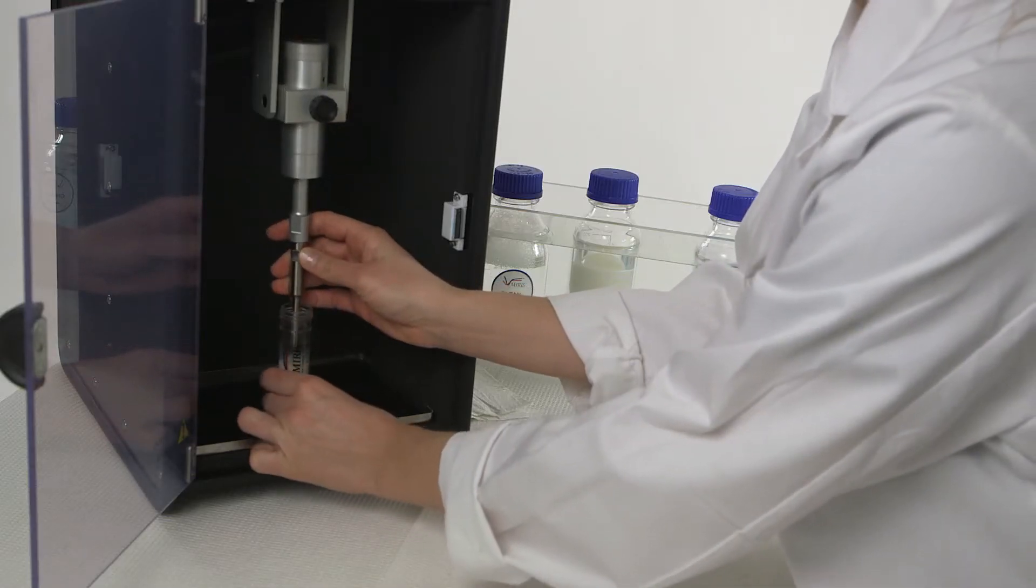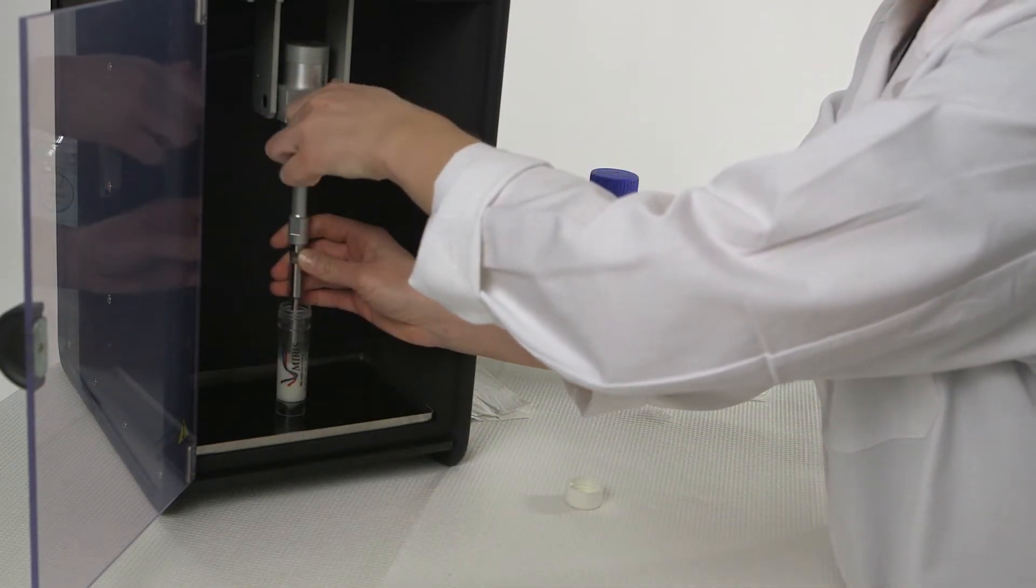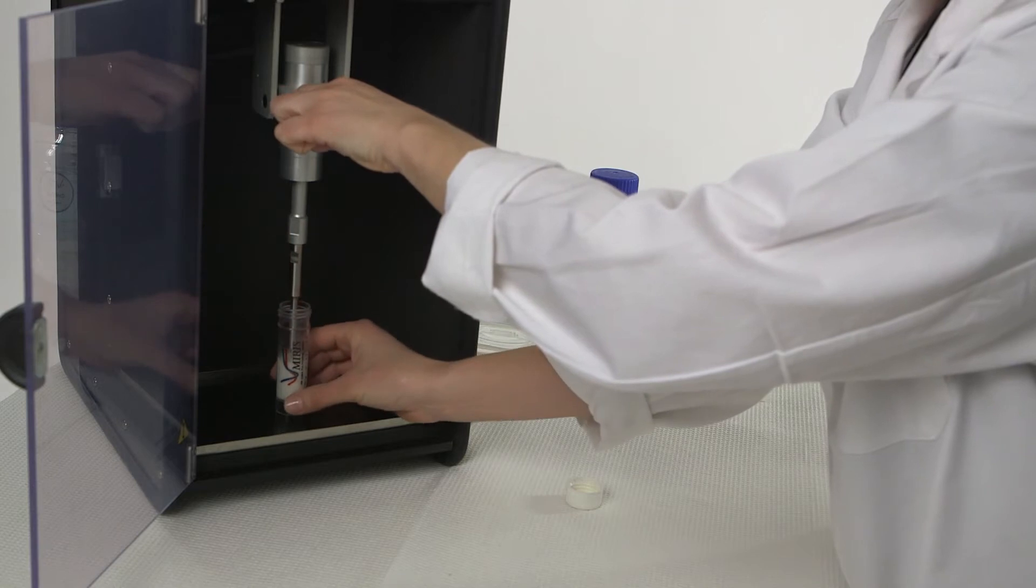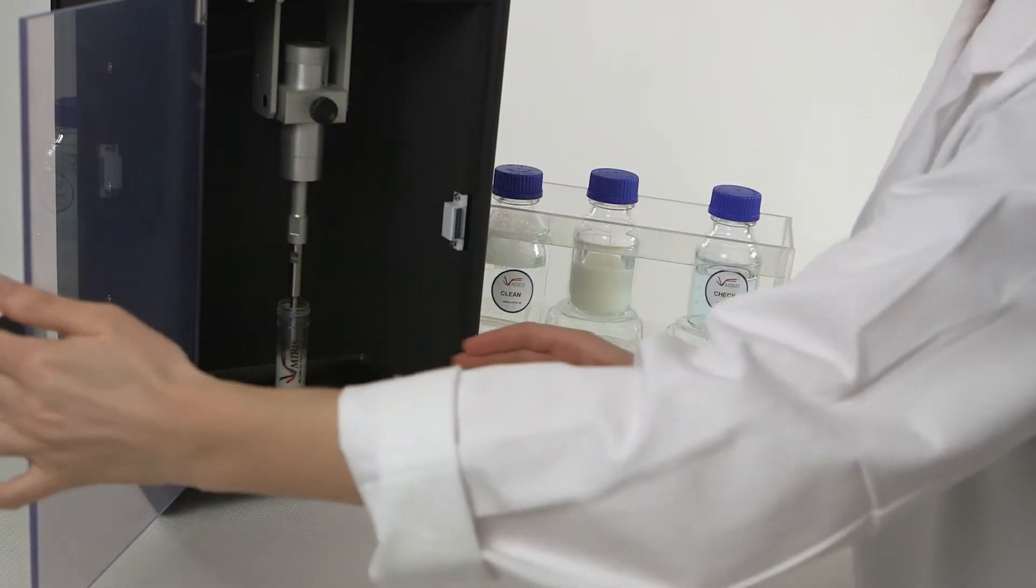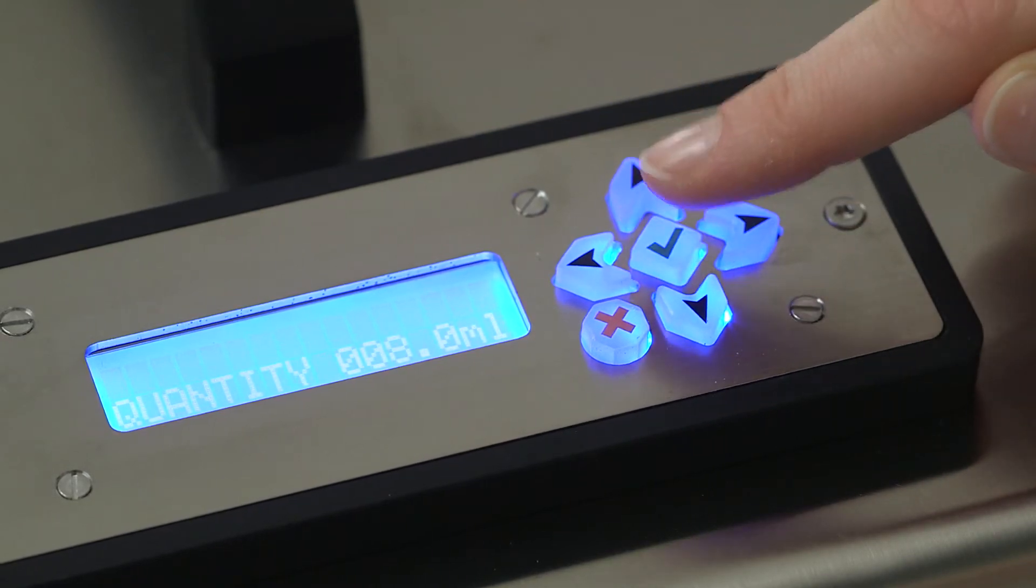All previously frozen samples must be ultrasonically homogenized with, for example, the MERS sonicator. Set the sonicator to the volume of the sample, and then the milk will be automatically homogenized with the correct time.